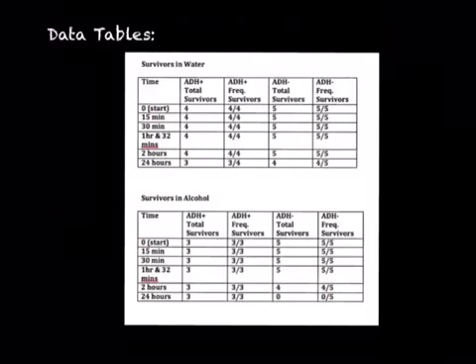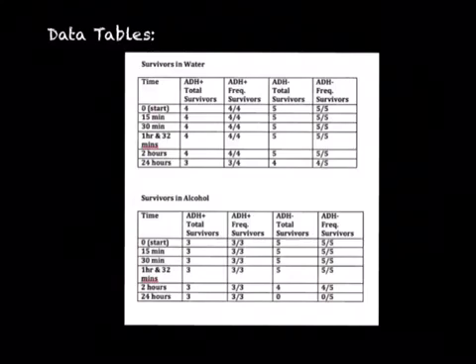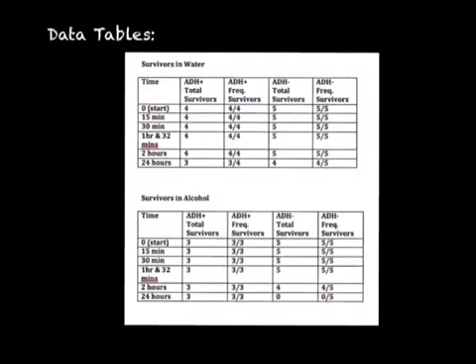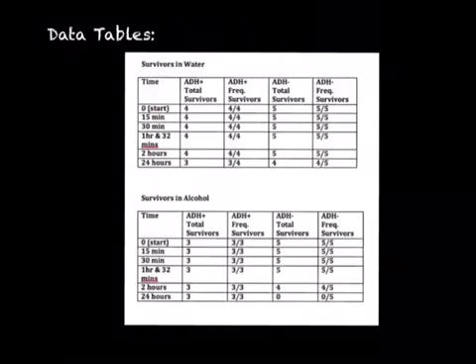In the vials that contained water, we observed that the fruit flies were more constantly active, and the fruit flies in the wine vials were not as active, and they tended to stay at the bottom of the vial. We also observed that at the 1 hour point, the wings of the flies in the wine vials were spread out, while the fruit flies in the water vials, their wings were tucked in.